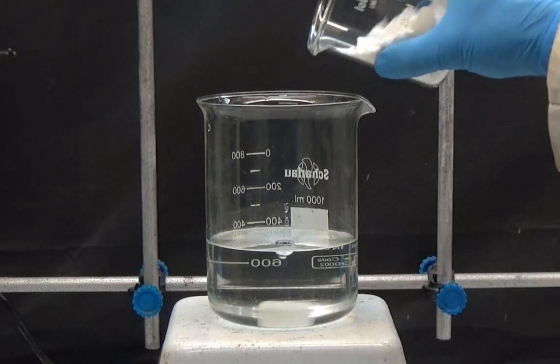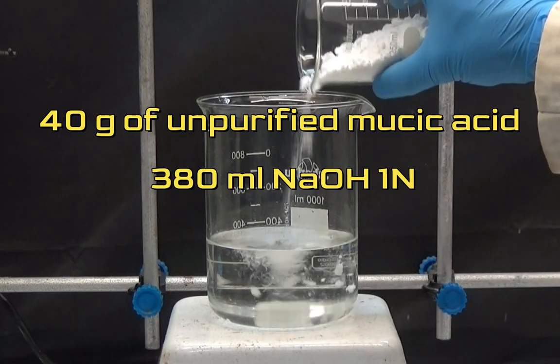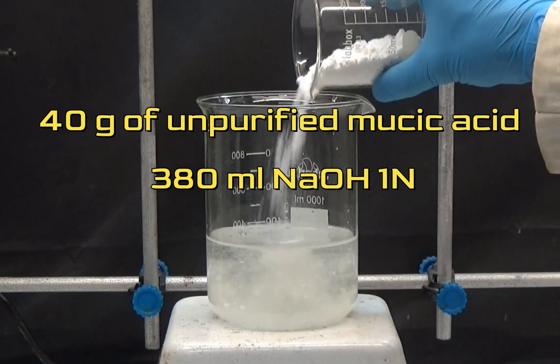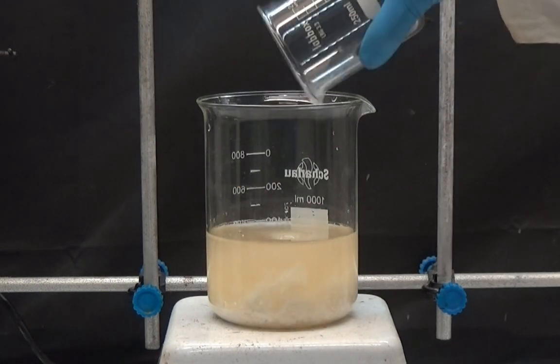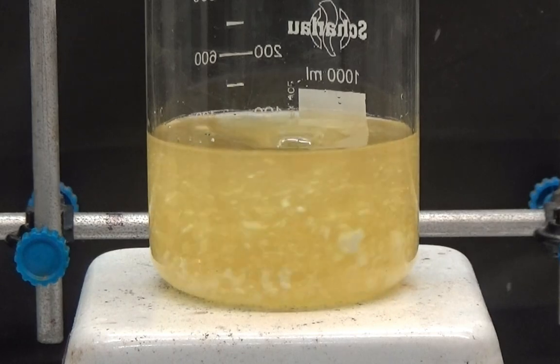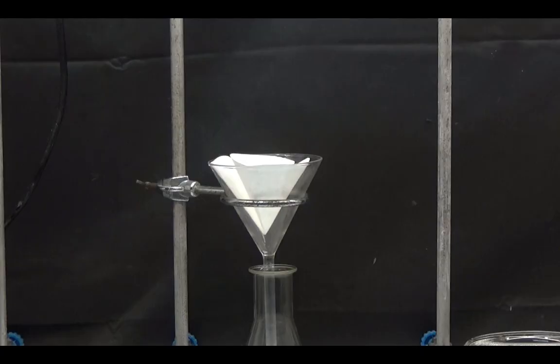During purification, I divide the obtained product into two parts, one of 40g and the other of 36.7g. We dilute 40g of final product in 380ml of normal sodium hydroxide solution.